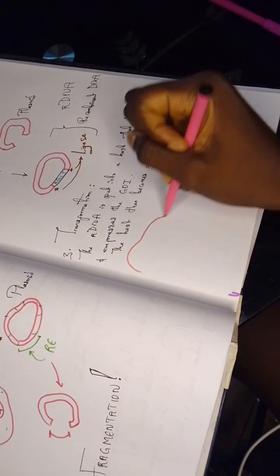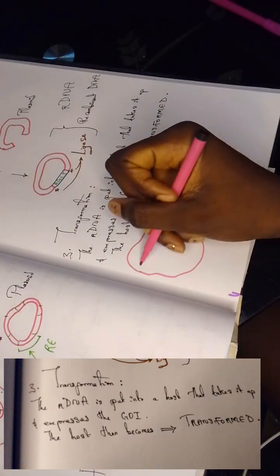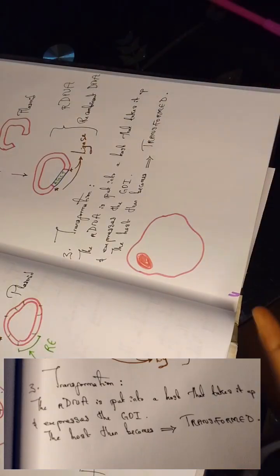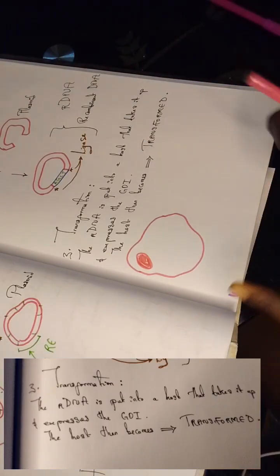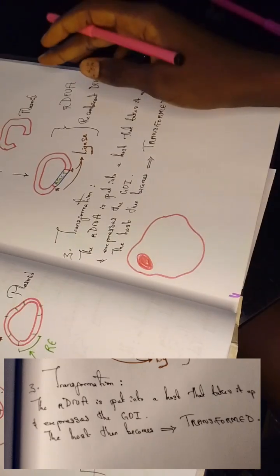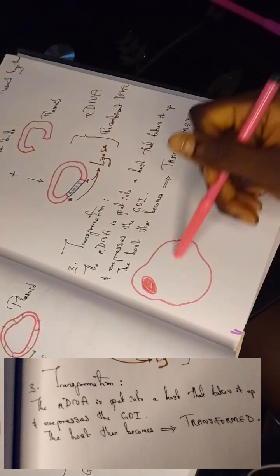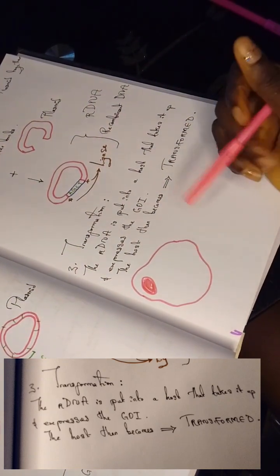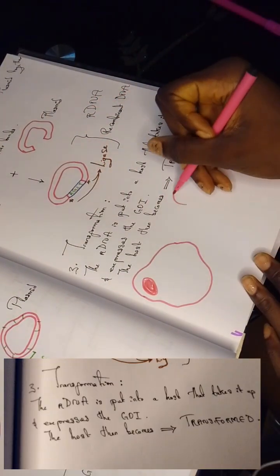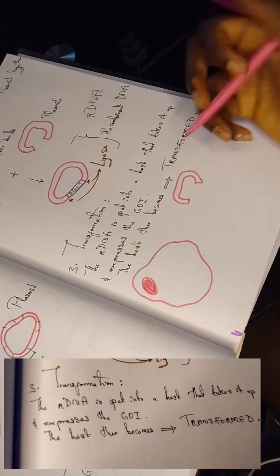transformation. Now in transformation, remember the bacteria, the one we got the plasmid from, that circular DNA material. So we get back the bacteria and then we put the recombinant DNA, this one we formed here, and insert it back into the bacteria. Now, when we insert this recombinant DNA into the bacteria, it becomes transformed. So that's basically the process of transformation.